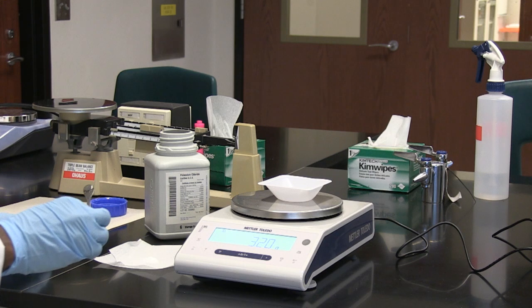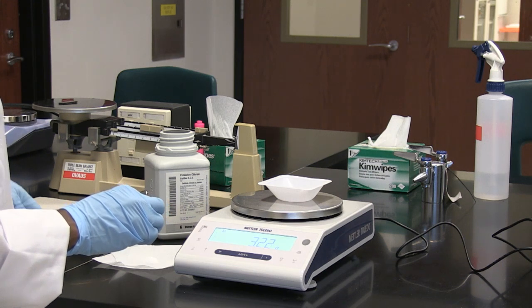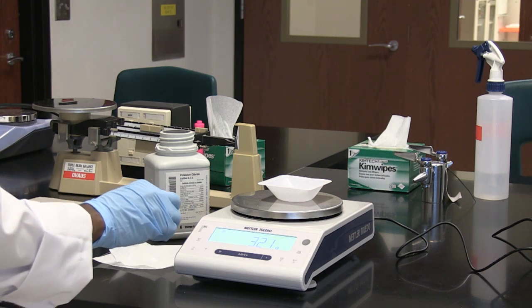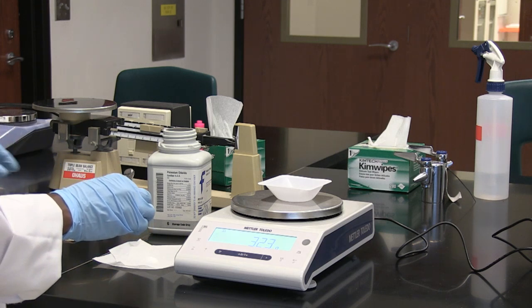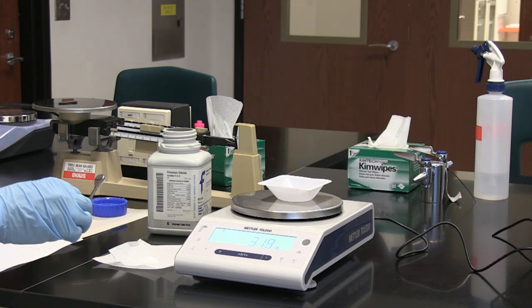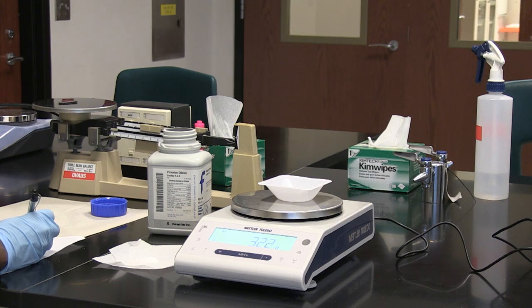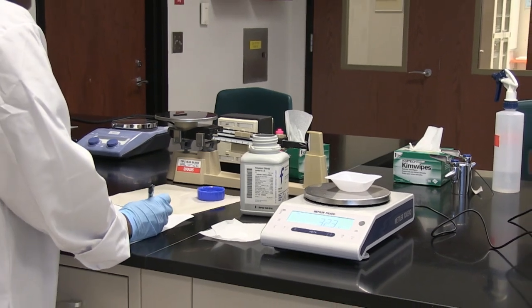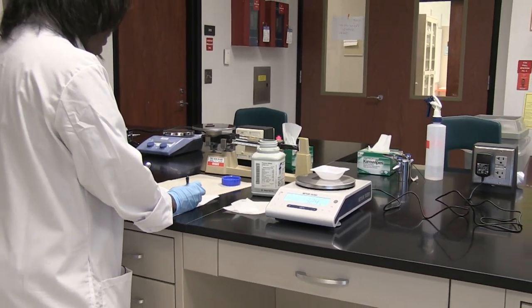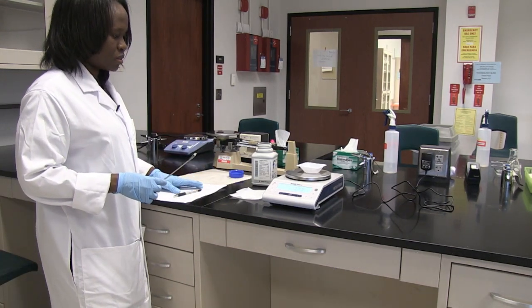So it's actually giving me around the figure of 3.22 to 3.23 grams. So I have been able to measure 1 gram of solid, of salt, by actually measuring the weigh boat first. Then the mass of the weigh boat plus the salt is 3.22. So if I subtract the mass of the weigh boat from the mass of the weigh boat and the salt, I get 1 gram. So that is how you can use your electronic pan balance in order to measure a solid.